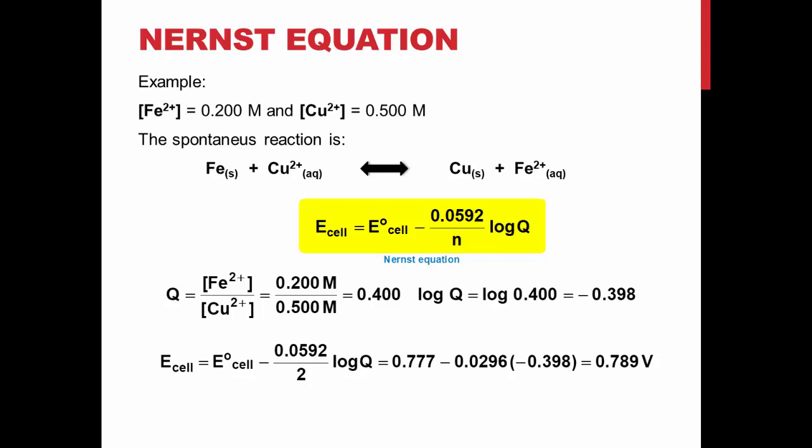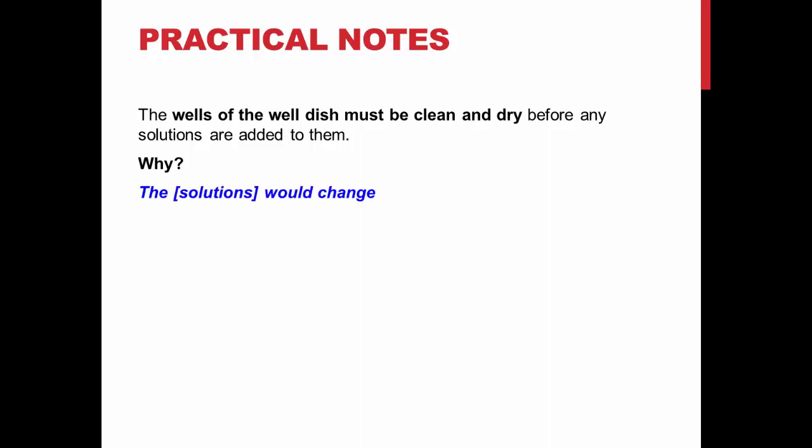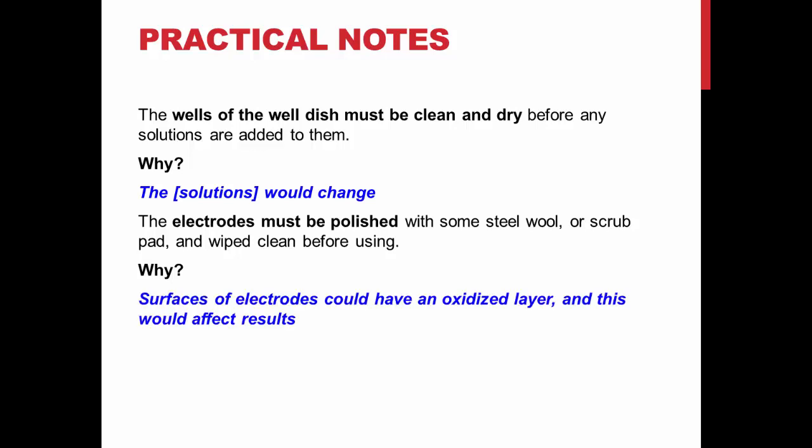Here are a couple of important things to remember when in the lab. The wells you use for your experiment need to be clean and dry. Water or contaminants could affect the concentration of ions in your solutions, which would have a negative effect on your results. The electrode you use also needs to be scrubbed with steel wool or a scrub pad and dried, to remove any oxidized material that could get in the way of your experiment.